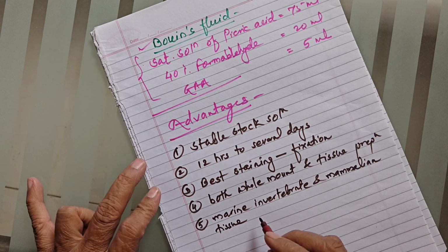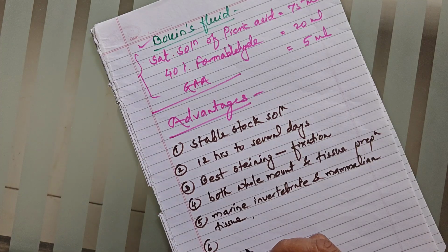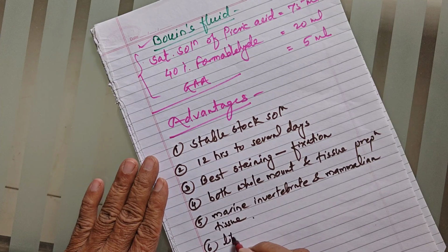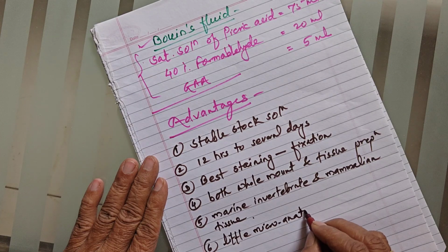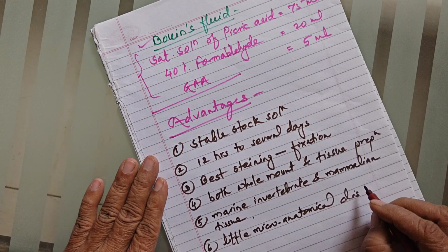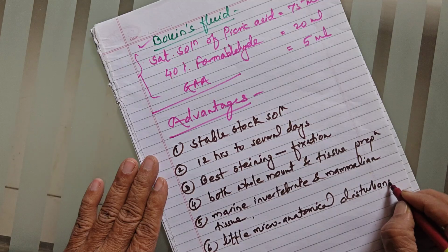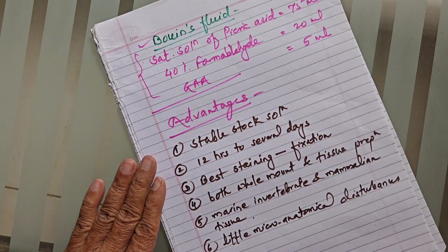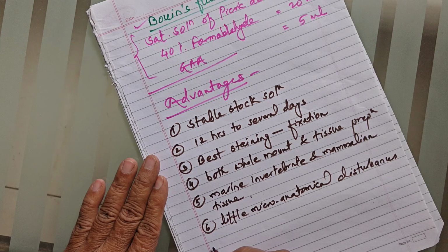Then by using this fixative, it produces very little microanatomical disturbance, meaning there are very little changes in the tissue after fixation.